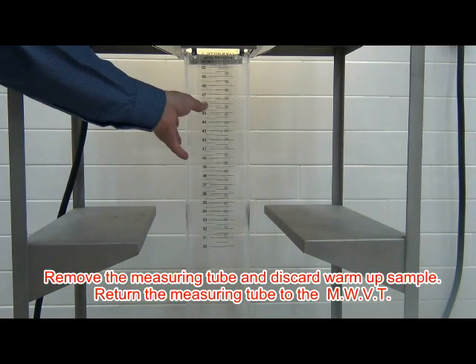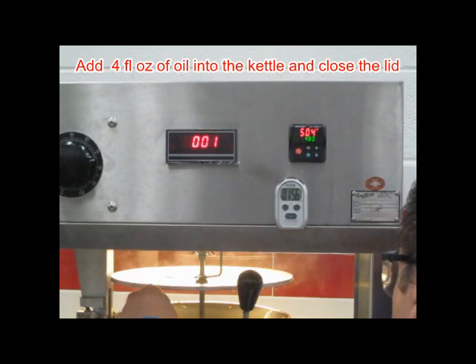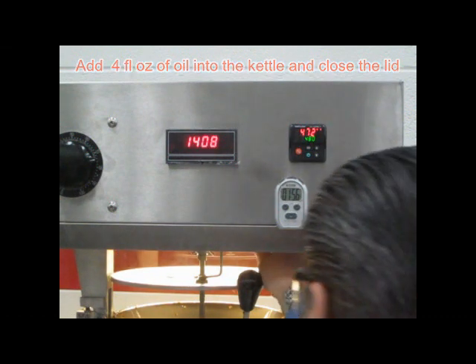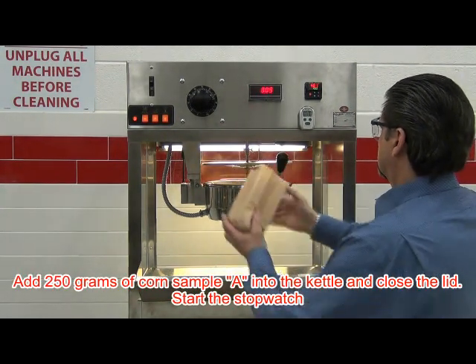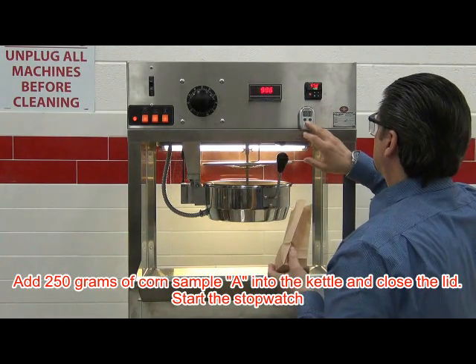Remove the tube and discard the warm-up sample, then return the tube to the MWVT. Add another four ounce measure of oil into the kettle and close the lid. Once the temperature reaches the set point of 480 degrees, open the kettle lid and add the 250 grams of sample corn A into the kettle. Start the stopwatch and close the lid.